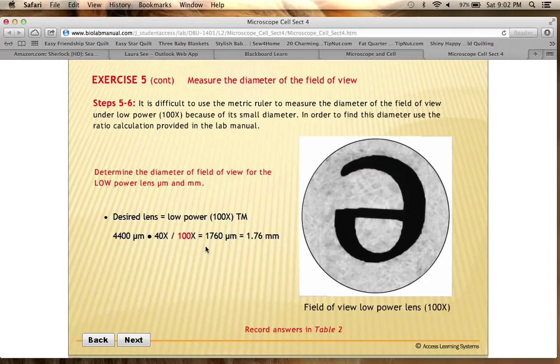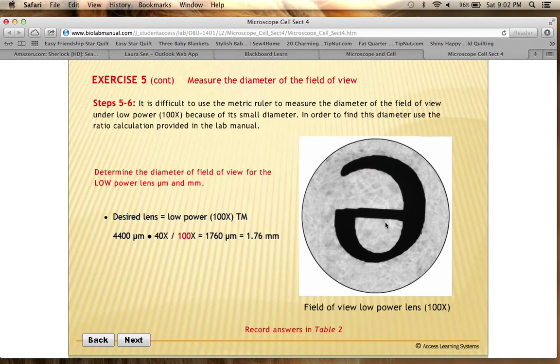Using this ratio, you can calculate that the diameter of the field of view under the low power lens is 1,760 micrometers, or if you convert that back to millimeters, it's 1.76 millimeters — that's how much you can see. The letter E shown is taking up about two-thirds of that total amount, since we're measuring the diameter of that circle as the field of view.